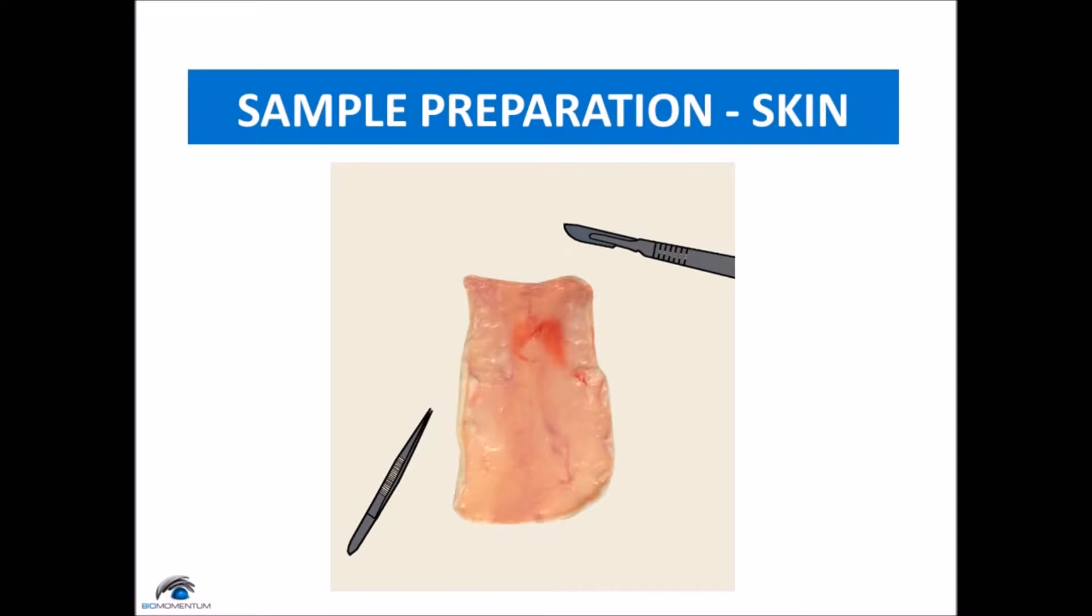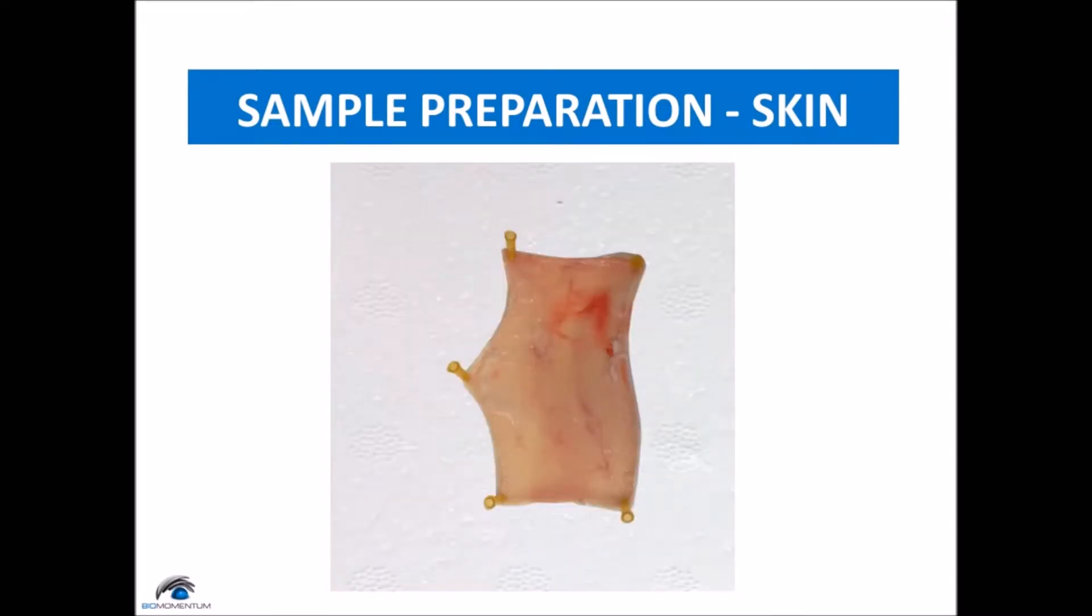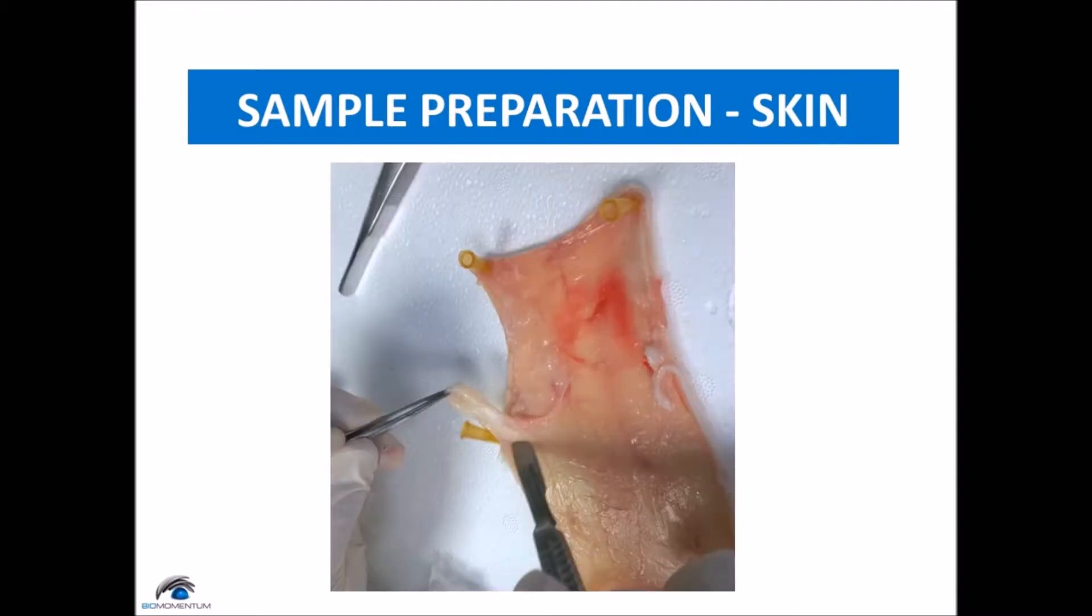Avoid keeping muscle and fat on the skin. Lay the rectangular shaped skin on the styrofoam board, hair facing down. Secure the sample by using needles. Now remove the tissue layer beneath the dermis.